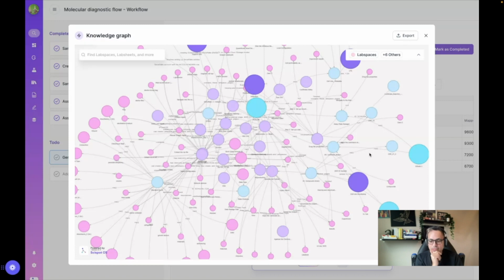And they're basically building their in-house models to contextualize this information, meaning train this based on the weightage that I have, or make sure that for this particular flow or this particular sequencing, you add this weightage to it. So there's a lot you can do on top of this data as you're building your IP or as you're building your platform.